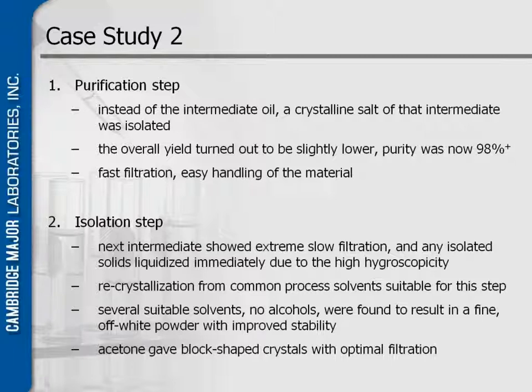Another step was an extremely slow filtration. It formed a thick cake of very fine particles sticking together, and as soon as the solvent was gone from the surface, water was attracted. So in fact, what you needed to do was a filtration with nitrogen flow on top of it, under very controlled conditions. As soon as you slow down that nitrogen flow or remove it, and you try to handle your compound, it liquefies immediately.